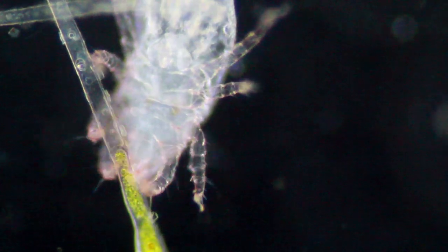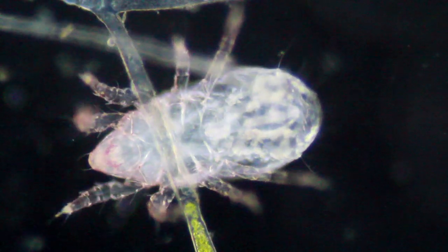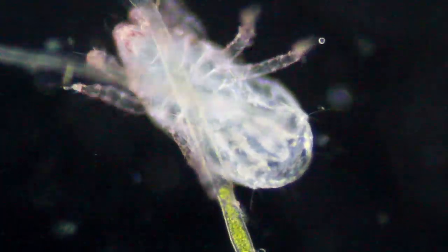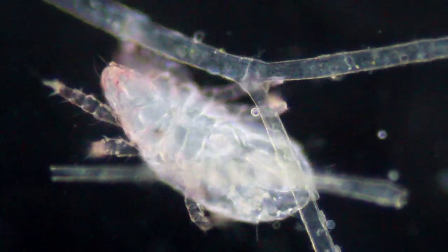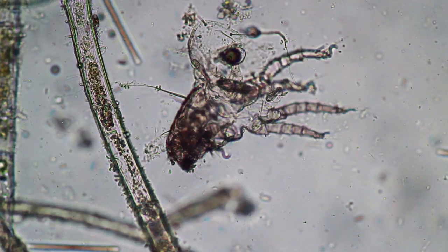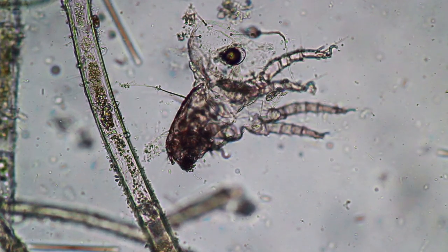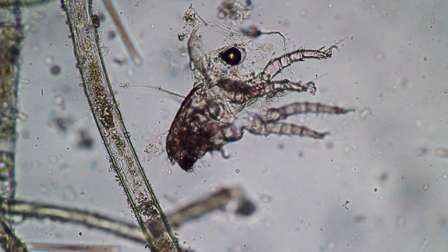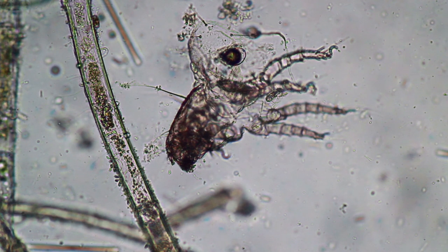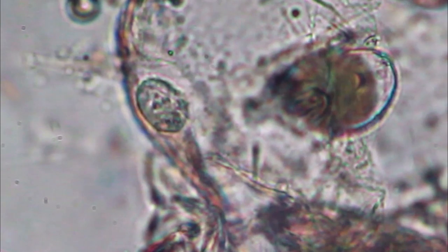The largest mites are basically the ticks, and they can be a few millimeters across and can be seen quite easily. Some mites feed on fungi, others on decaying matter, and as I mentioned already, many are parasites. Now they molt, meaning they shed their exoskeleton — and this could be an empty exoskeleton or it could be a dead mite, I'm not quite sure. In any case, the exoskeleton is the hard outside covering of arthropods — insects also have such an exoskeleton.